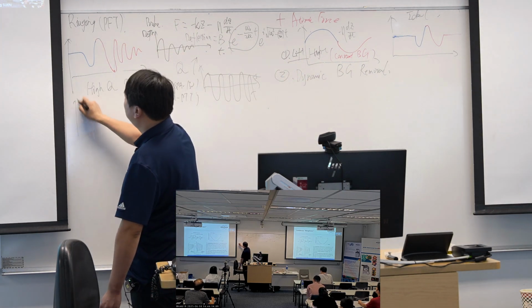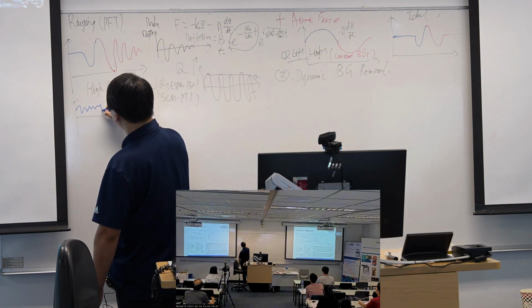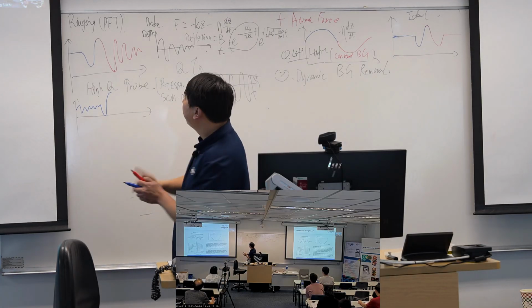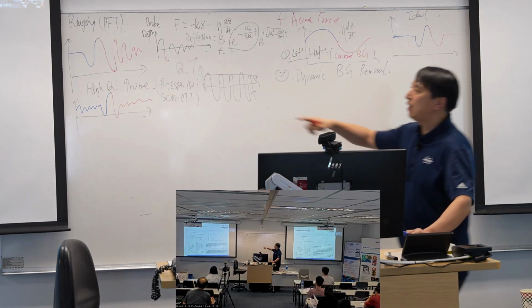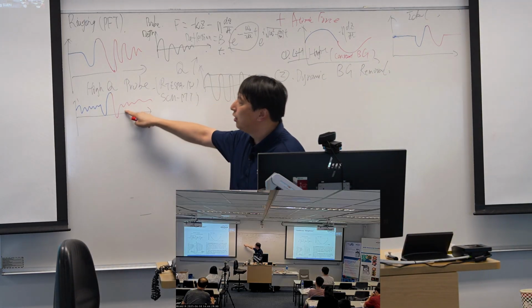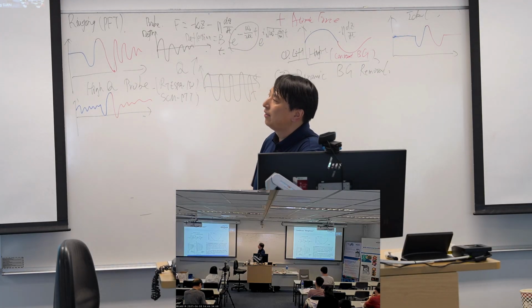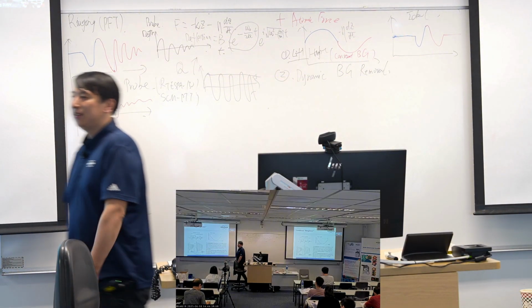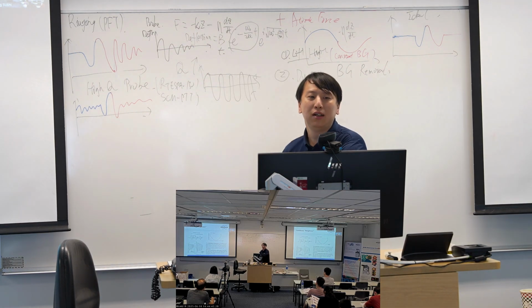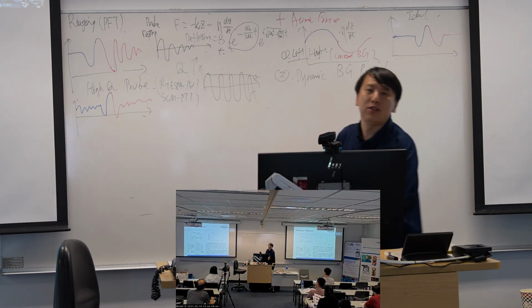You may observe force curves like this. You may see this kind of damped oscillation, it's always there. We call this phenomenon ringing, and it is caused by the damped oscillation.